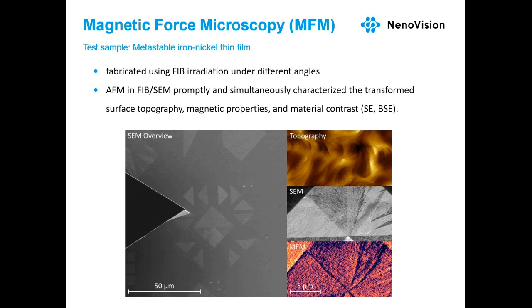An example is a metastable iron-nickel thin film prone to oxidation in air, so the structure was fabricated using focused ion beam irradiation under different angles inside the SEM, and the AFM probe was immediately navigated to characterize the magnetic and topography signal together with secondary electrons. In the SEM and MFM images there are different phases and different magnetic domains for each irradiation angle. In the MFM signal, brighter and darker spots are visible where the domain direction changes across the out-of-plane direction toward or away from the surface.